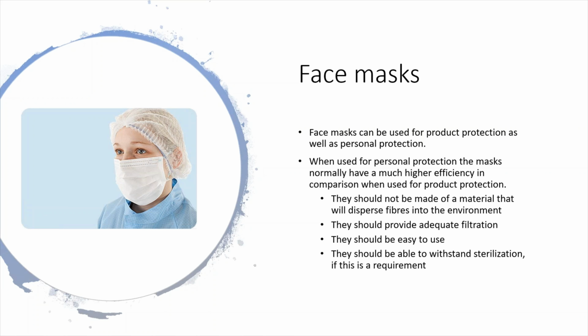For the aseptic processing areas, masks must be sterile and must be shown to be able to take the sterilisation process. And you need to make sure that your environmental monitoring around masks can detect the organisms you're concerned about. One of the biggest organisms of concern are the streptococci, and there are some varieties of Tryptic Soy Agar, TSA, out there which cannot actually adequately detect streptococci. So you may have a problem with poor mask control without knowing it, because you're not actually able to detect the very organism that you're concerned about.